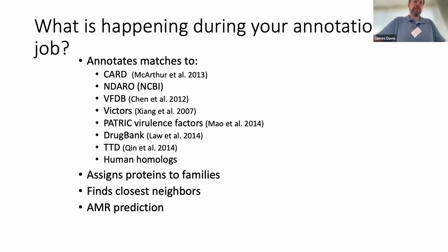Right. These specialty protein databases that we match against serve as a safety net for a researcher who is familiar with a different nomenclature or is worried that they might miss something on our side. We are often surprised because in all of these workshops, there are always people who are working with non-pathogens. And even for them, the RAST and the BV-BRC annotation system has been working wonderfully.